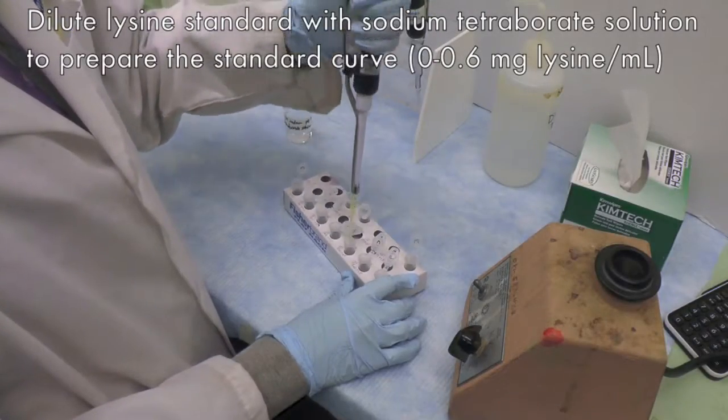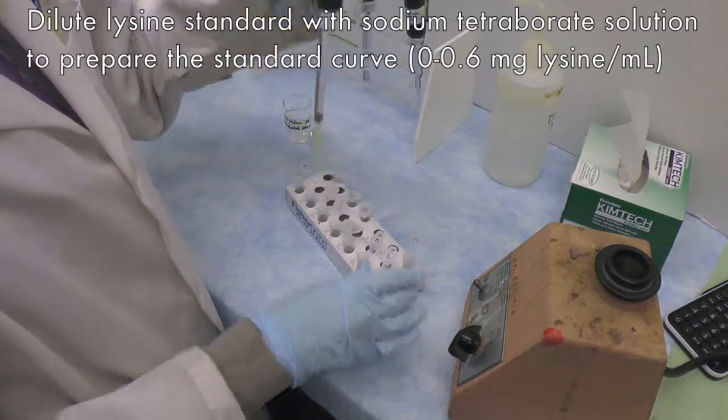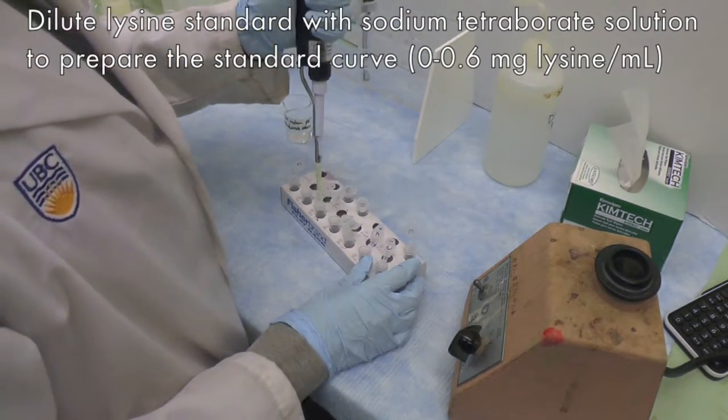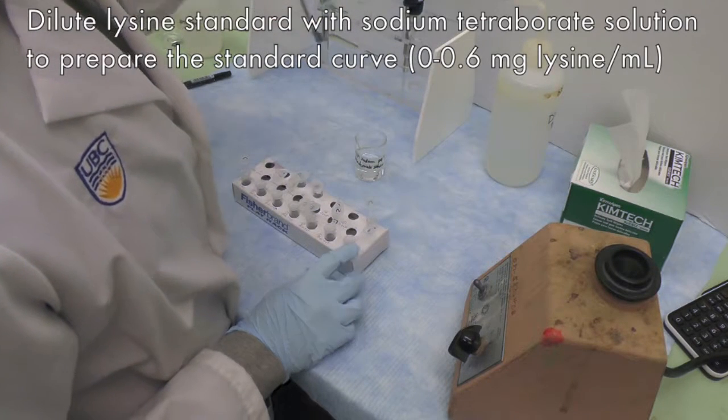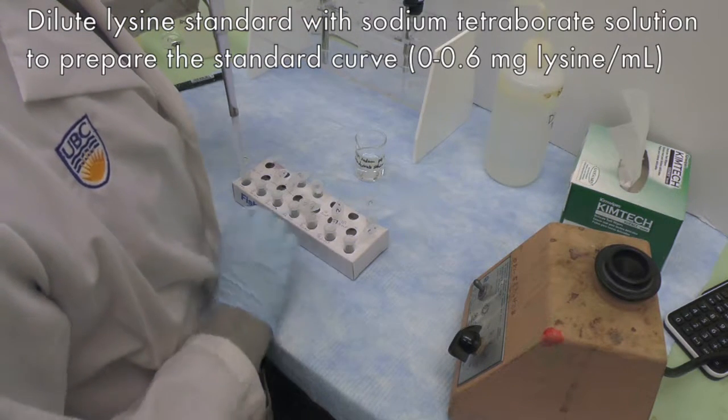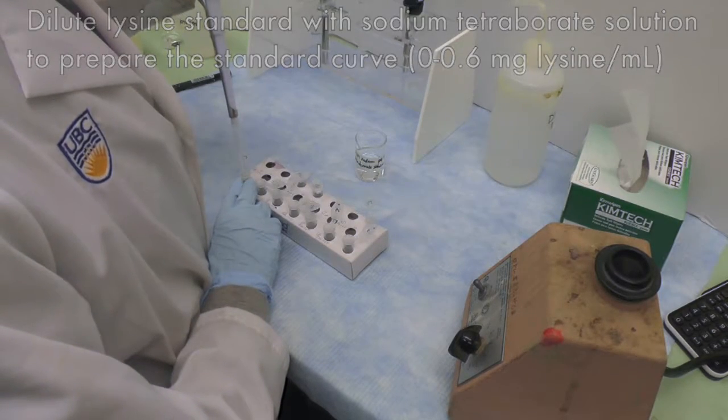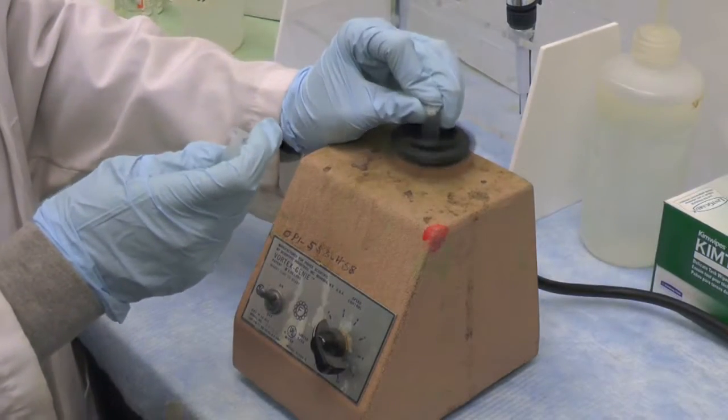Next, prepare the standard curve by diluting the 10 mg per milliliter lysine standard with sodium tetraborate solution at pH 9.0 so you have 5 to 6 standards between 0 to 0.6 mg lysine per milliliter. Vortex the standards.